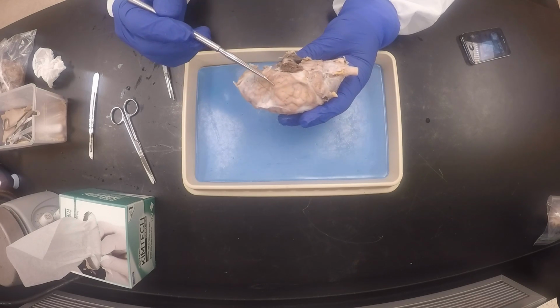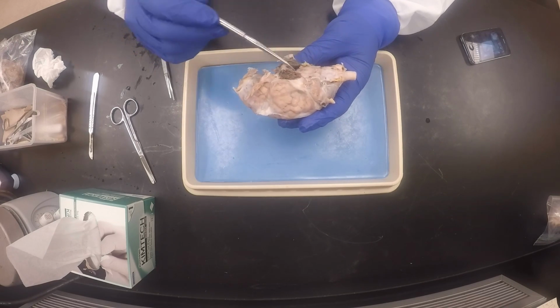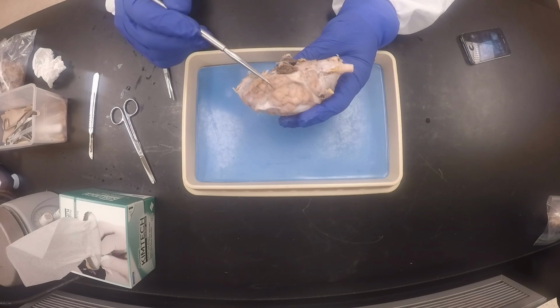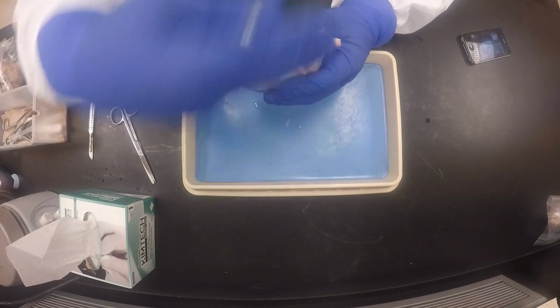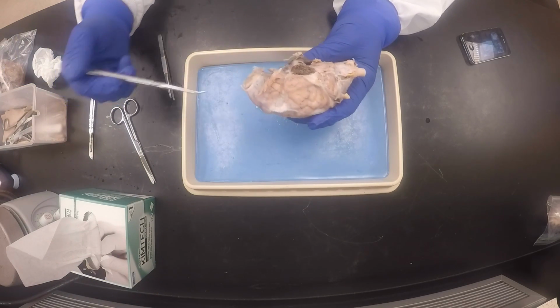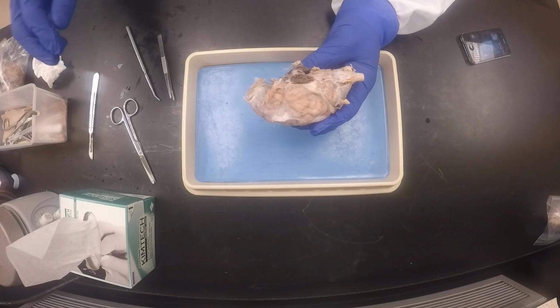Come here like that. You leave this down here, otherwise if you remove it, it comes off with the cranial nerves, and you don't want to do that. Then you cut here, then you come over here, and then you just peel it off on the top. Okay, so we can see the gyri and the sulci inside.